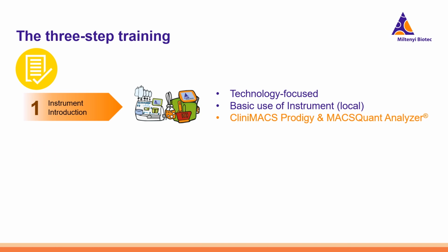The instrument introduction is very technology focused, so it's intended to transmit the knowledge of just the basic use of the instruments, just to make sure that the staff already knows this once they are receiving the higher stages of the training. And it's usually performed by the local Miltenyi specialist.